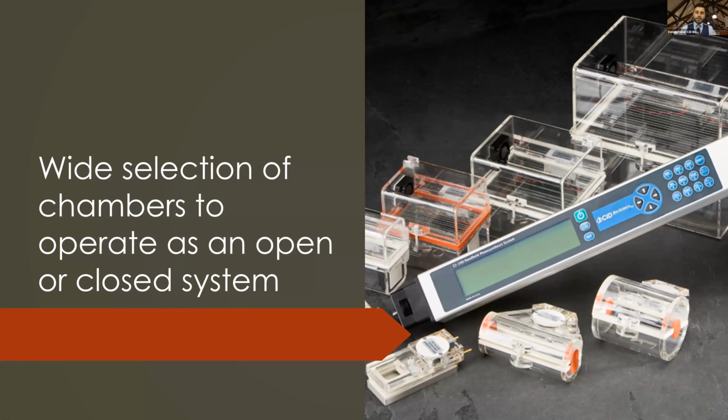They work, again, either as open or closed system chambers, and some also accommodate a stem entering the chamber while sealing around it. Open systems are configured so that the air is continuously passed through the leaf chamber to maintain carbon dioxide at a stable concentration. Measurements of photosynthesis and transpiration are based on the differences between carbon dioxide and the relative humidity in the air. The rate of carbon dioxide uptake is used to assess the rate of photosynthetic carbon assimilation, while the rate of water loss is used to assess the rate of transpiration. And this is determined again based on the leaf area.